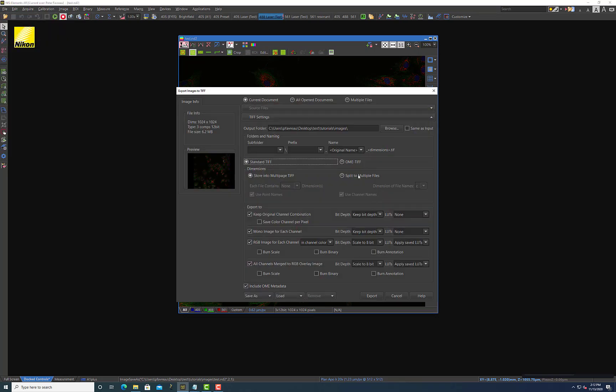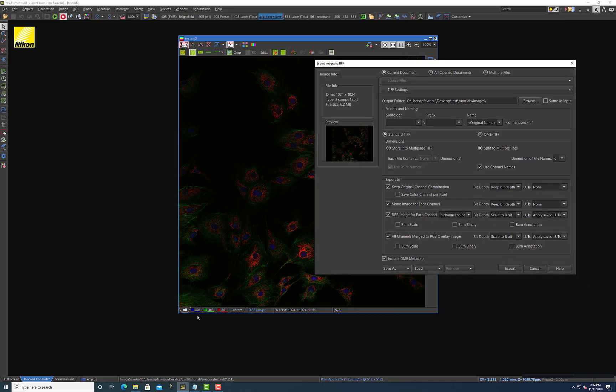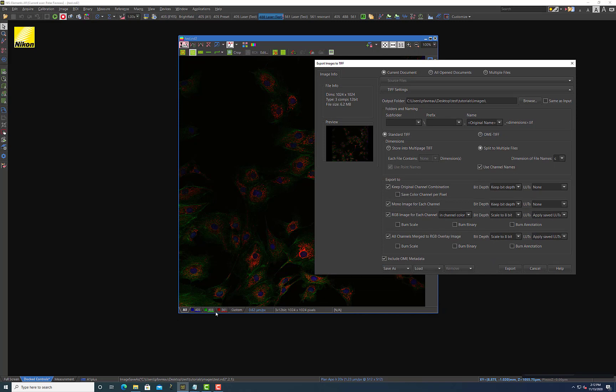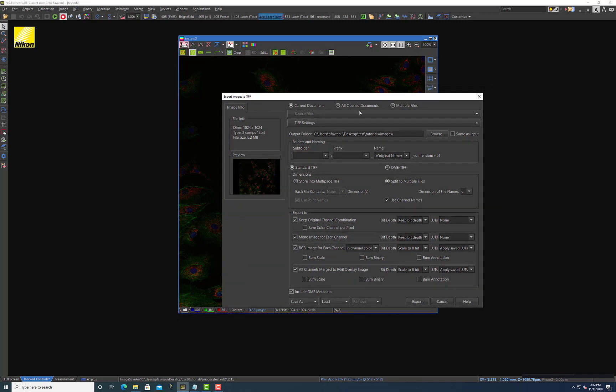So the first question here is whether you want to store your data into a multi-page TIFF or if you want to split it into multiple files. You can load these multi-page TIFFs in other image software like Fiji. So it doesn't really matter. It used to be the case that a multi-page TIFF might be difficult to load in image software. It's not really the case anymore. But just to be safe, I usually like to split them into multiple files. The dimensions of the file names are going to be represented by the C value and it's just going to use the channel names. So that means that down here it's just going to use 405, 488, 561 as my file names. And all this will become apparent once you actually export and save the file.